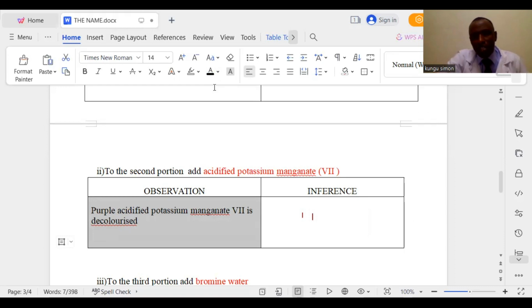Now, in this particular case, if we had used potassium manganate(VII) earlier, before confirming that ROH is absent, you would expect me to mention the 3 of them: that the double, the triple, and the ROH are present.